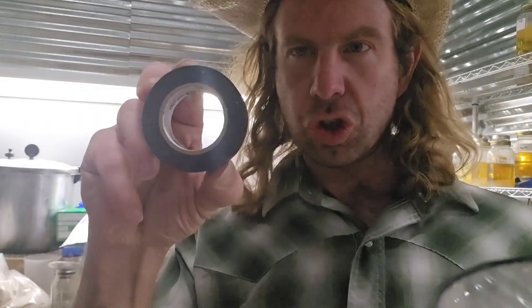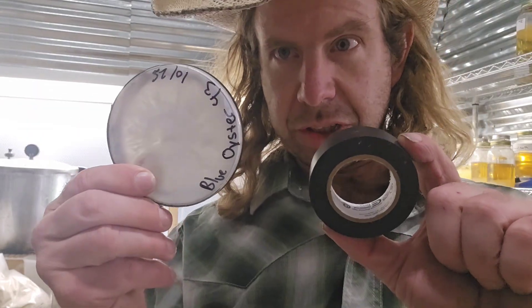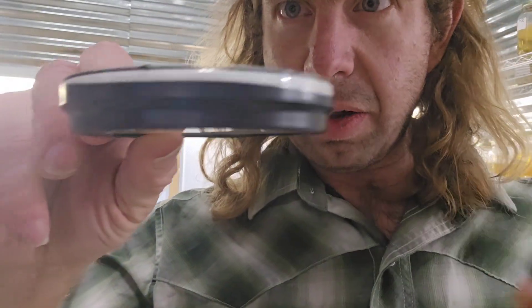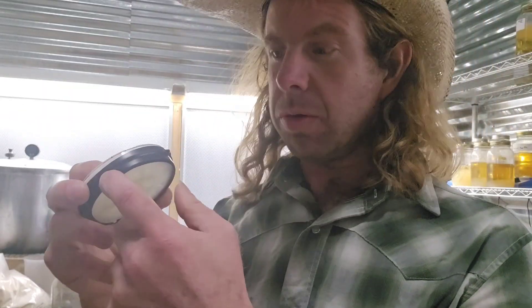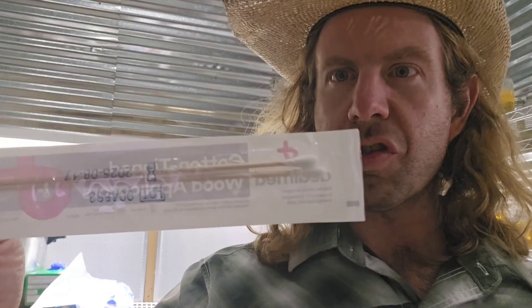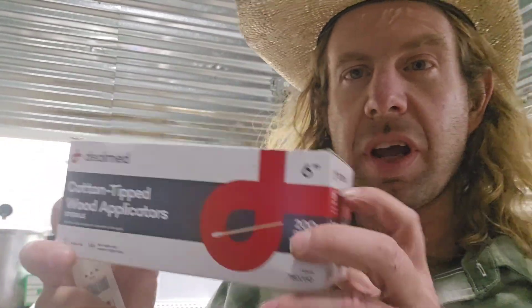Number twenty-seven: electrical tape. Why electrical tape in the mycology lab? I like to use electrical tape to wrap my petri dishes. Check it out — look at that perfect seal. I actually like this over parafilm because you never get any little pinholes in it, and it's pretty cheap if you buy it in bulk. Number twenty-seven: electrical tape.